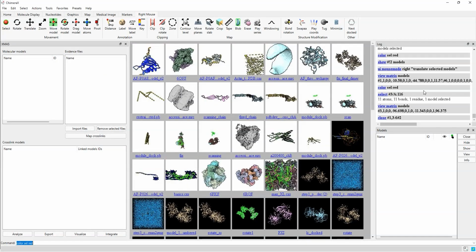Welcome back, everyone. Again, one of the series of our XMAS tutorials. What we want to do today, after we got into some basics, so now we know how to handle structure, map crosslinks, get some basic statistics and explore the data, import, export, molecular modeling, and so on.